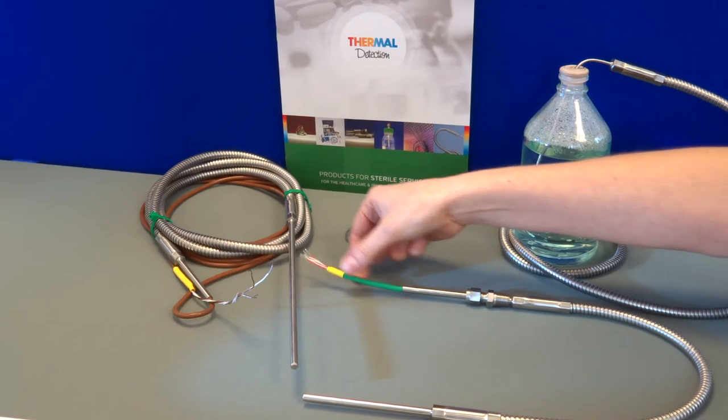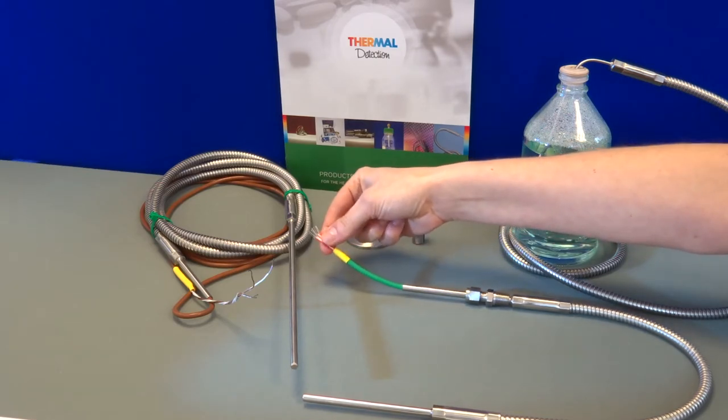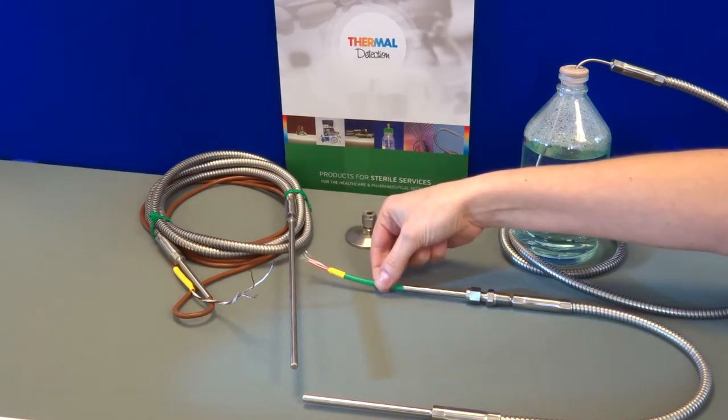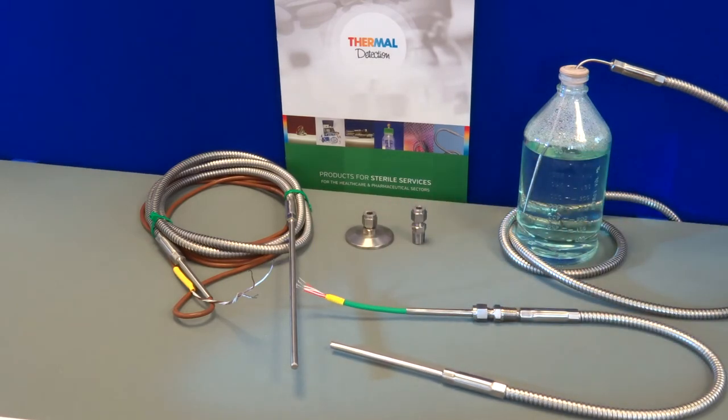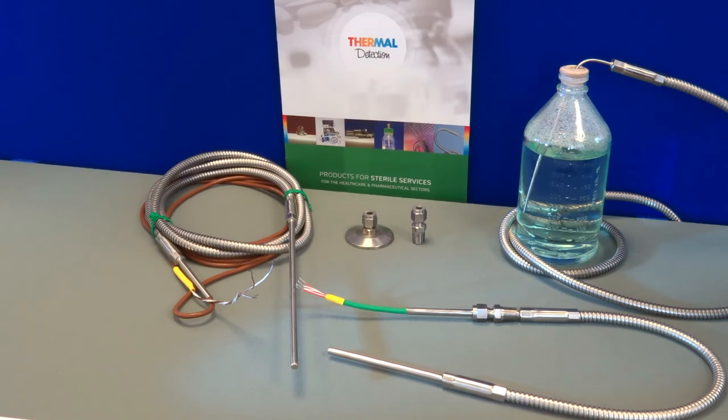The cable consists of PFA insulated wire with a thick-walled silicone jacket which is FDA approved. The cable is manufactured strictly for Thermal Detection to our own specification and can also be provided with USP6 compliance.